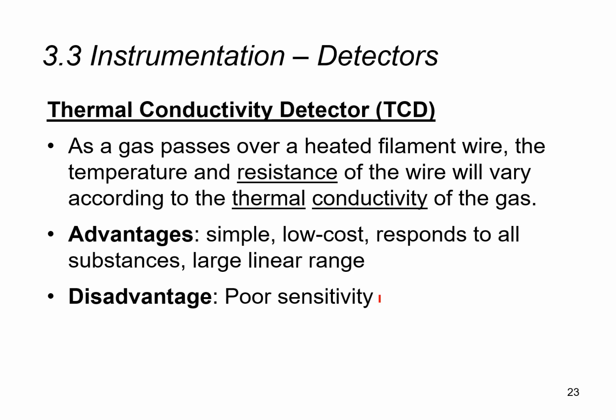Now, the main issue with a thermal conductivity detector is that it is not very sensitive.